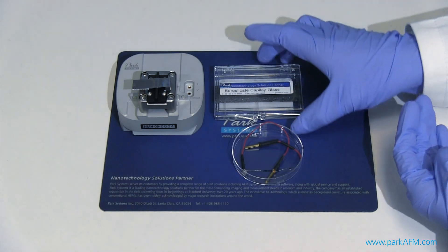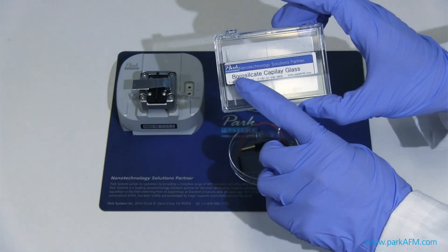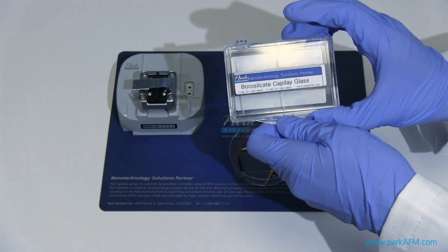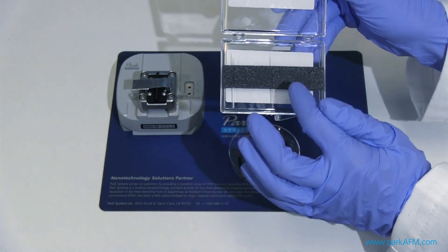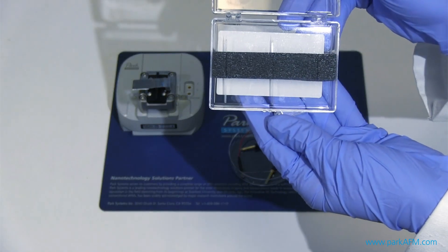The nano pipette is usually made of either glass or quartz. The inner diameter of the pipette is only 100 nanometers.